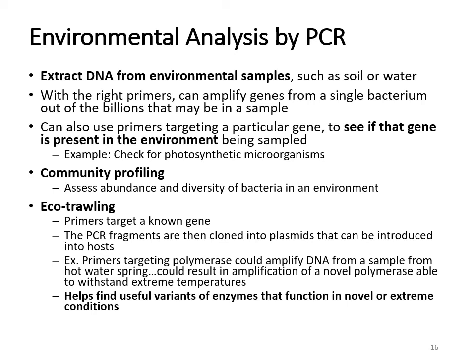It's also very powerful in the environmental field. I'm not going to go into too much detail here, but I basically wrote out a lot on this slide just in case you're more curious about how it's actually used environmentally. But basically, you're able to target bacterial genes to see if they're contaminating certain areas, or to find particular metabolic aspects that might be valuable from different bacteria.